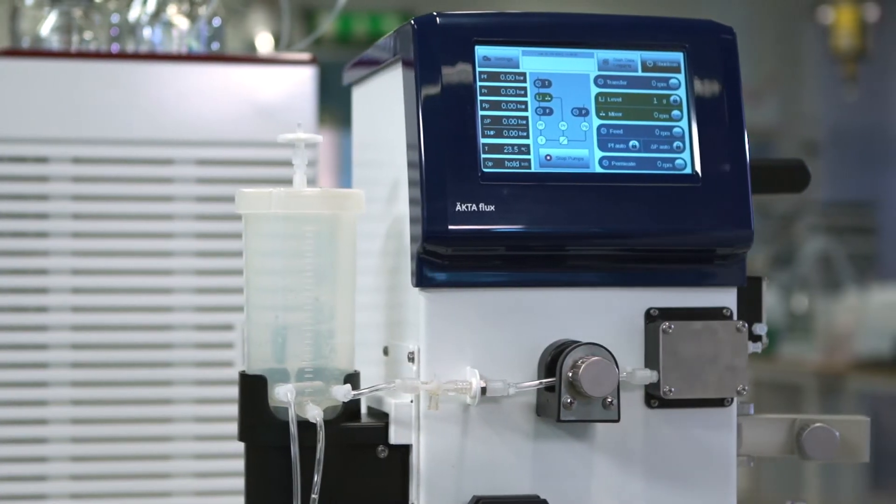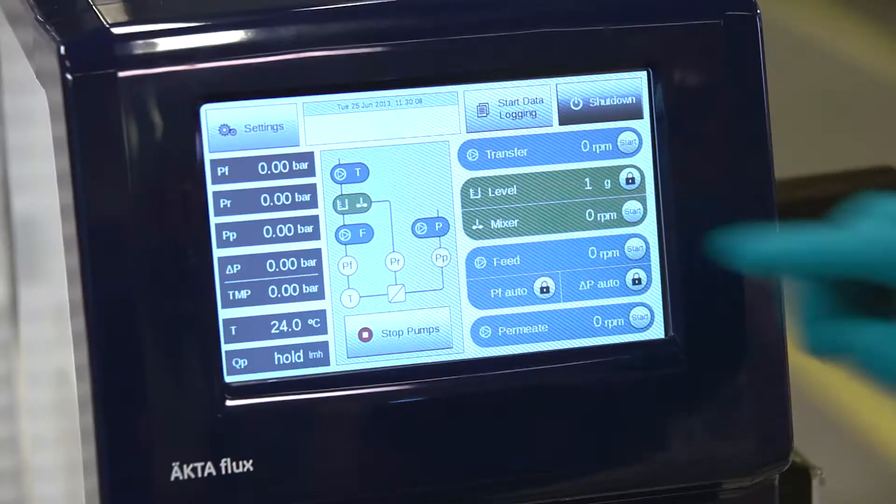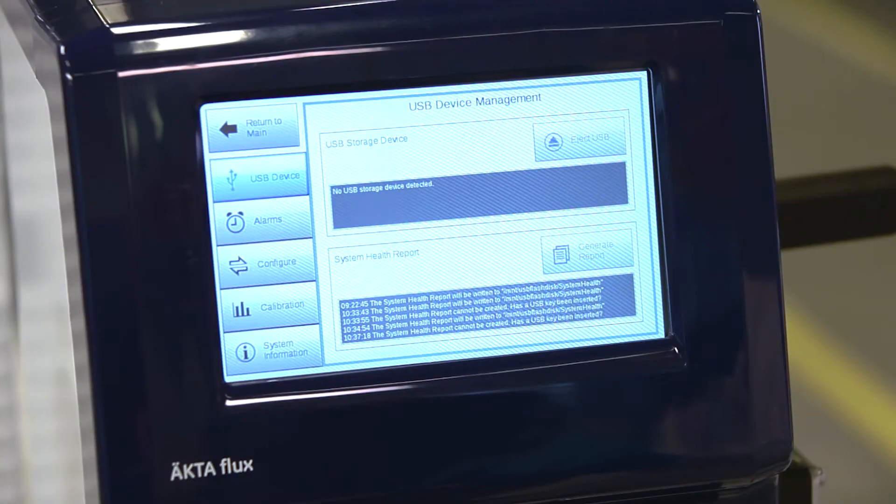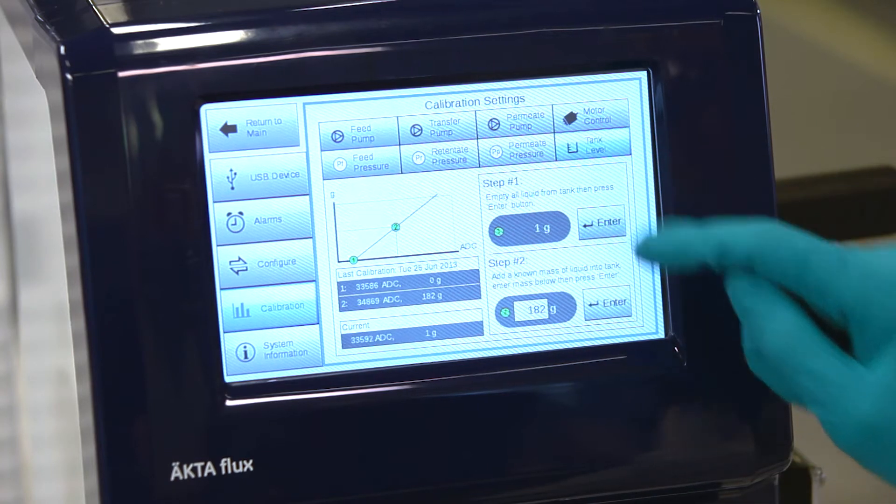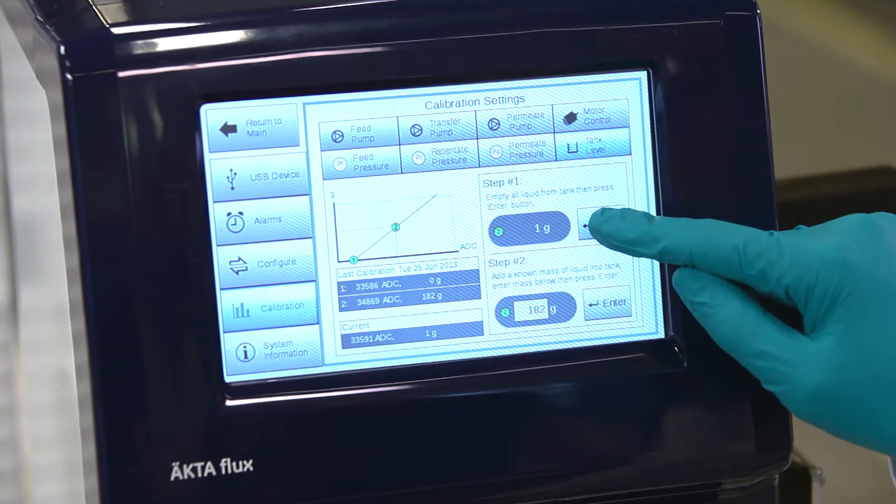To calibrate the load cell for accurate weight measurement, start with an empty reservoir. Choose settings on the touchscreen, press calibration, then press enter under step 1 for zero point calibration.